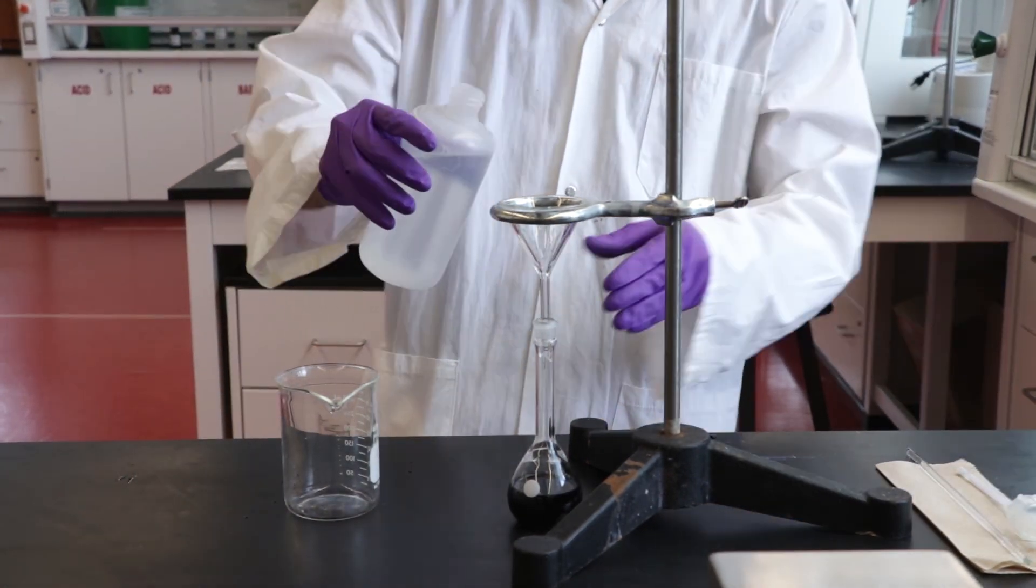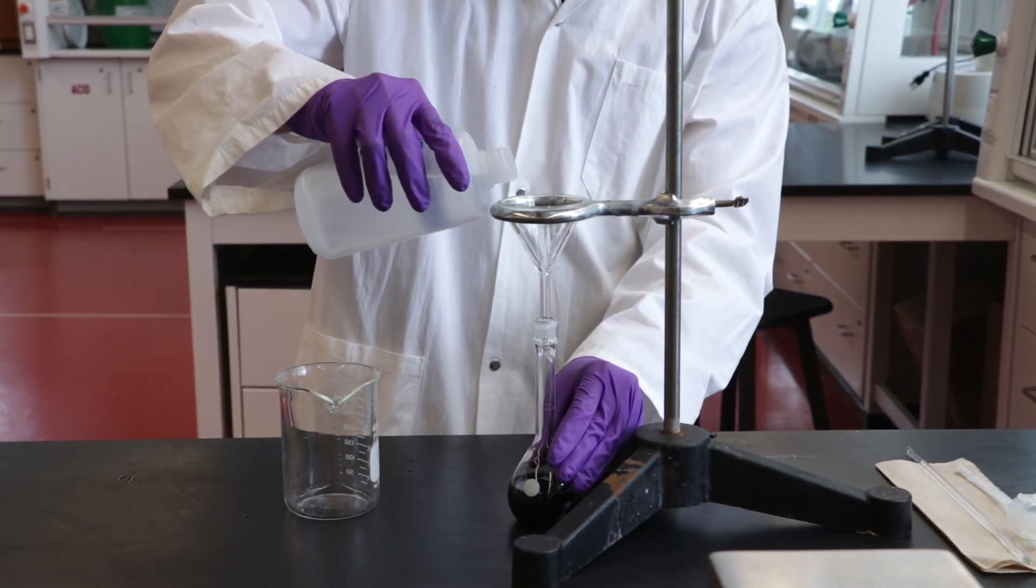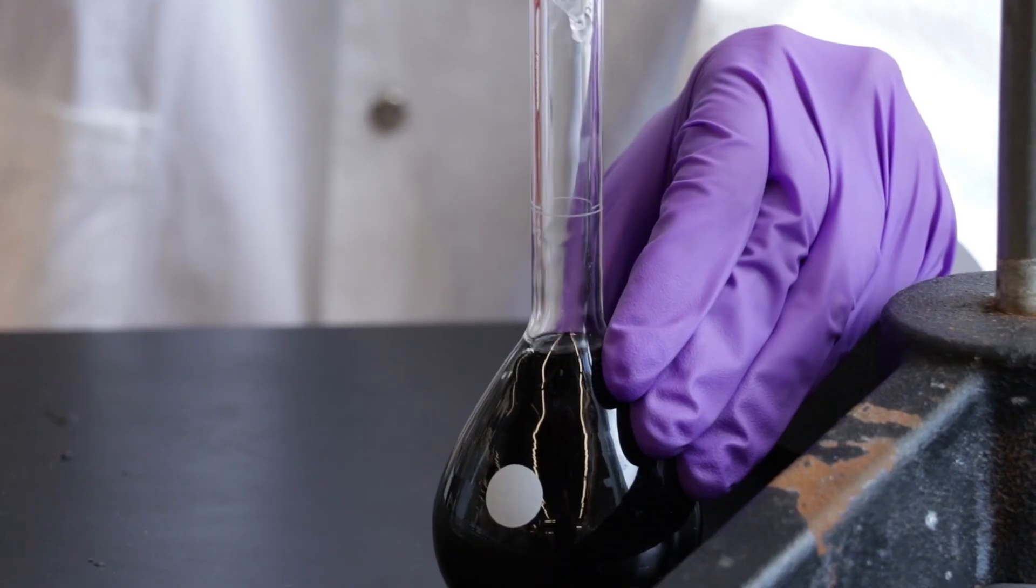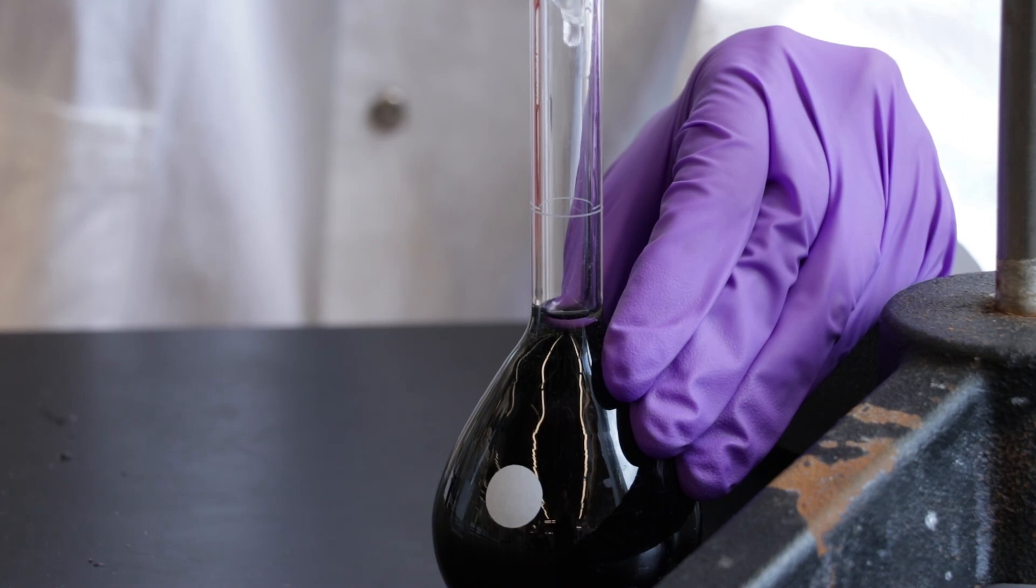Carefully fill the volumetric flask until the solution is 1 to 2 centimeters below the etched mark. Remember to be careful when doing this as the volumetric flask will fill up faster than you think.